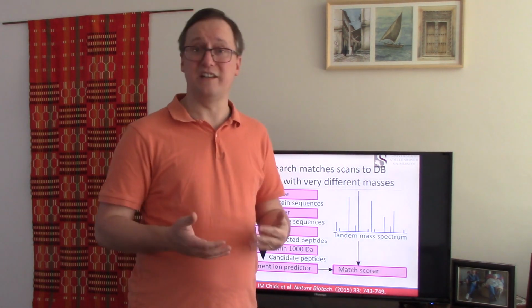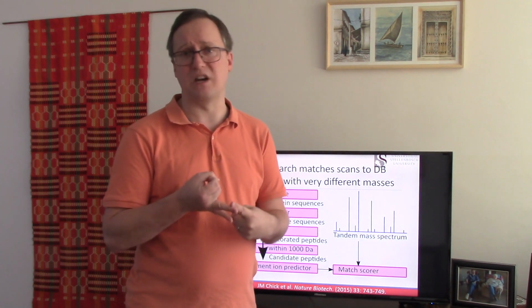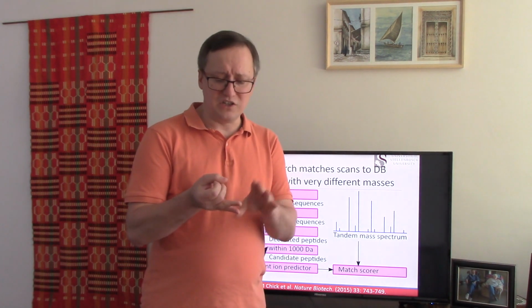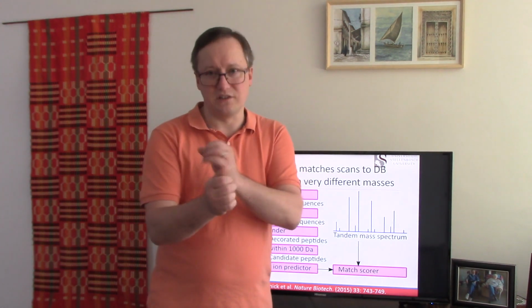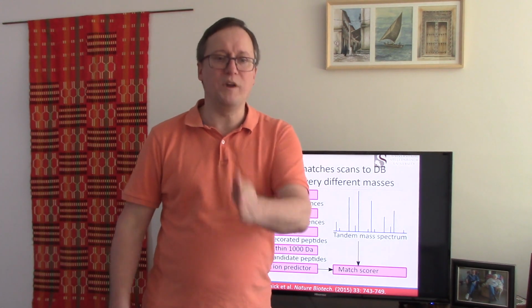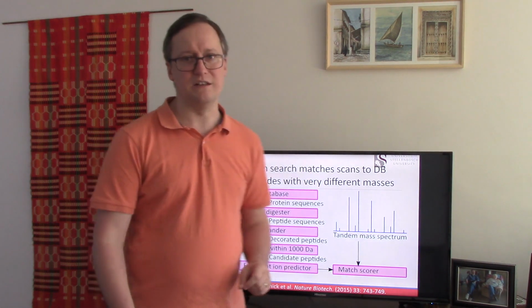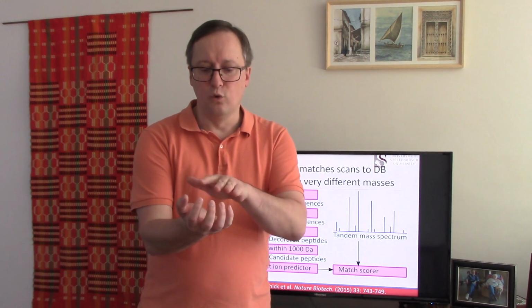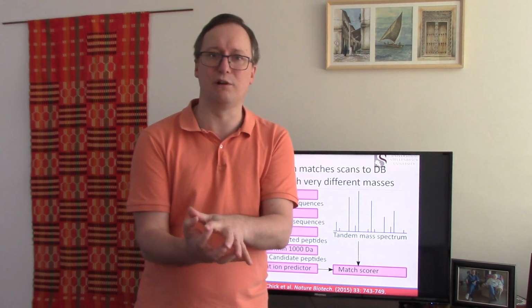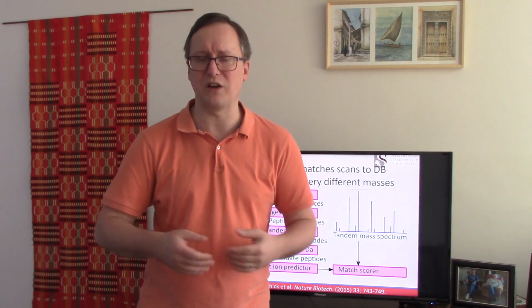But today, a lot of the data sets we work with either come from QTOF instruments or they come from Orbitrap style instruments like the Fusion and so on, using HCD. These tandem mass spectra are very, very high resolution and give us a very certain measurement of what this m/z is for this fragment ion. That means that our ability to use fragment ions as high discrimination engines in their own right, to say that we know these fragments and no others are observed for this tandem mass spectrum, and we know their masses very, very accurately, is a very strong filter for deciding whether or not a peptide sequence matches to this spectrum.